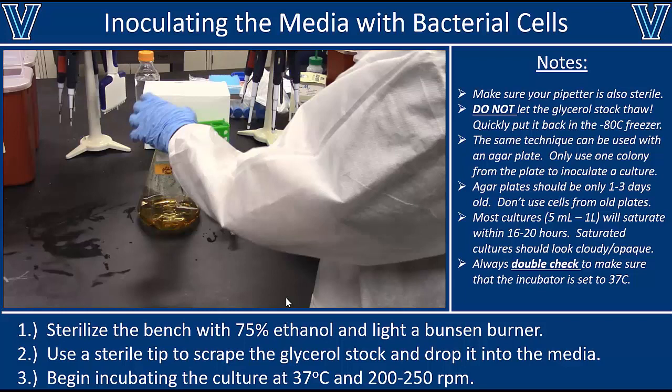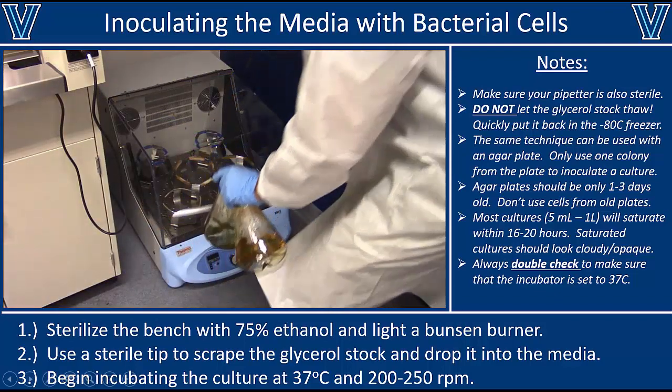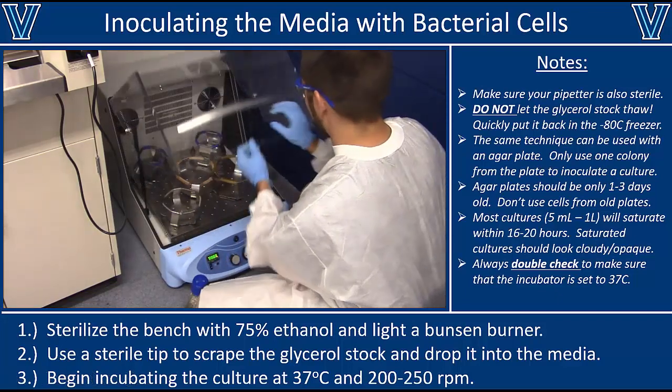All you need to do is dip the tip and shake it around a little bit — that will make your life easier. Also, inoculating a culture with a colony from an agar plate is essentially the same process: get a sterile tip, scrape off one colony, and then dip and shake or eject the tip into the media. Once the media is inoculated, you can bring it over to the shaker incubator and make sure it is secured to the shaking platform.